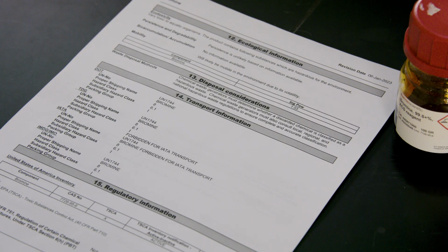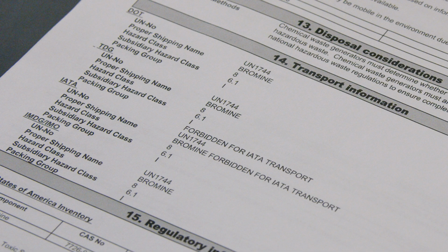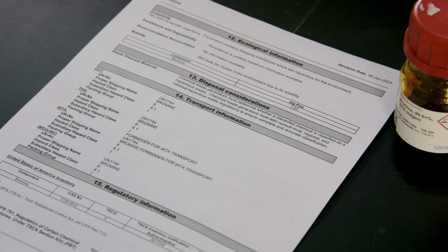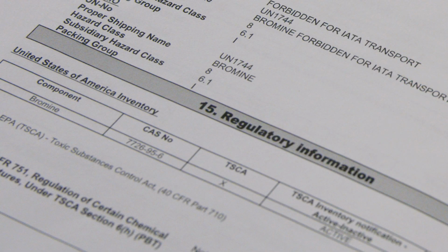In Section 14, Transport information, you'll find details on how the chemical should be safely transported. Regulatory information in Section 15 lists any specific regulations related to the chemical. Always stay compliant with the law.